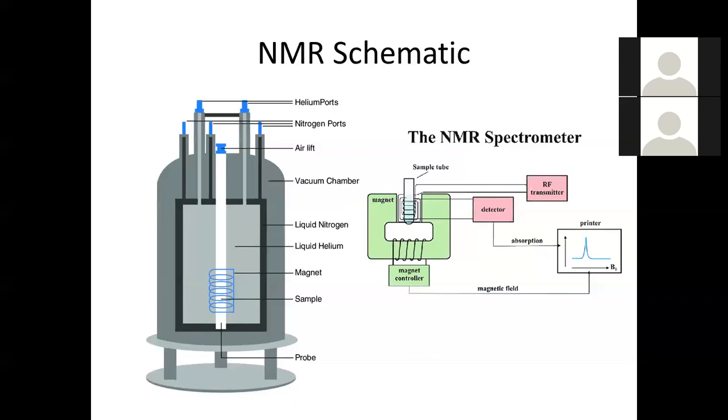The reason for that is if you want to have an extremely powerful, strong, permanent magnet, the easiest way to do that is to have a superconductor material that has theoretically almost zero electrical resistance, and then apply a very strong current across that material, and that will charge your superconductor with a magnetic field, and it will actually hold that magnetic field.